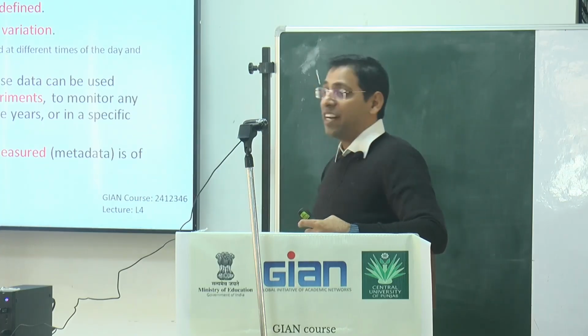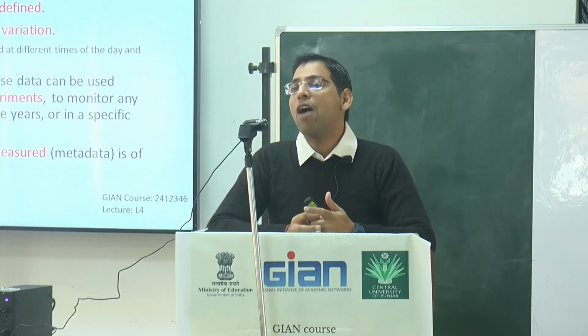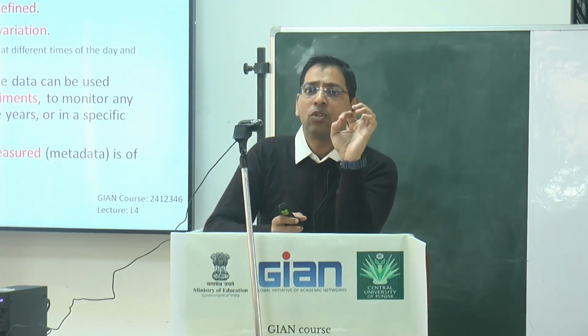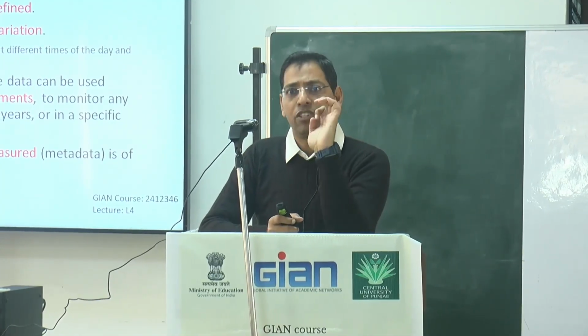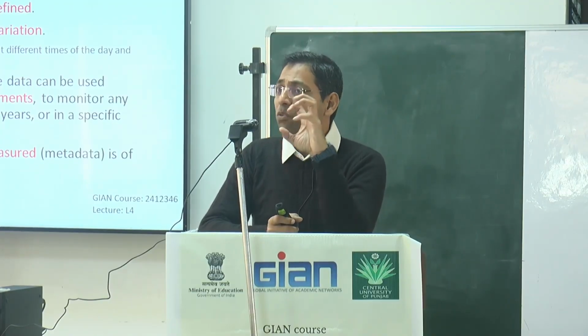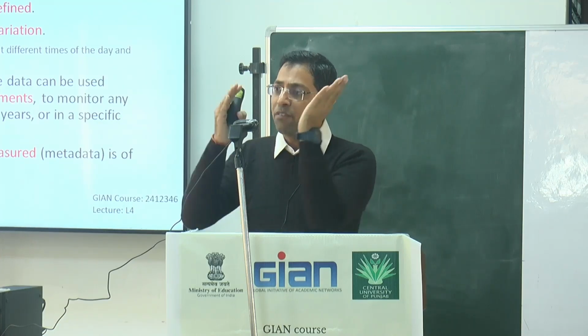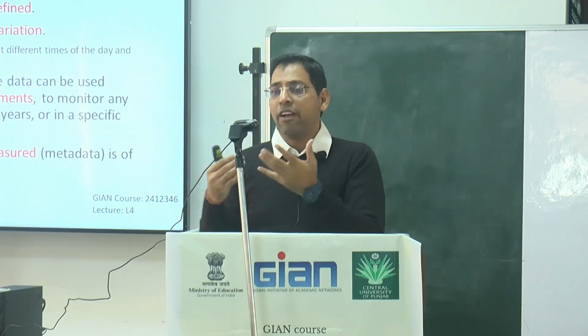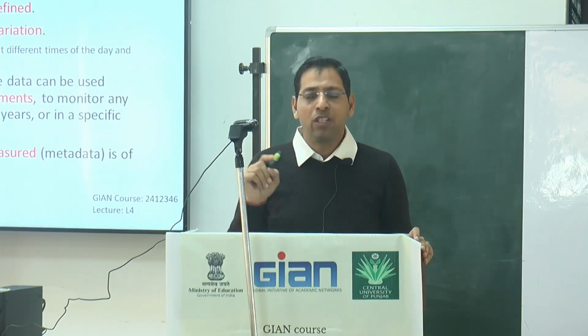Now, the point is that if you are designing some experiments, you have to fix yourself on a particular variety, particular cultivar, particular genotype, and you have to fix the area from where you collect the sample. And remember, those areas have some specific shadow. Even if you think that 365 days are the same, you might be wrong.